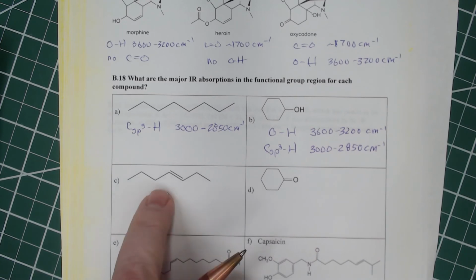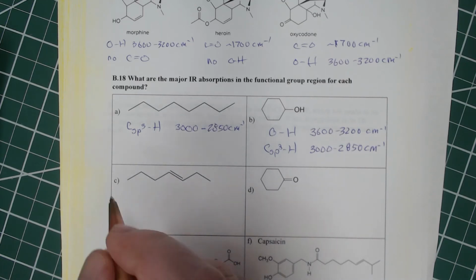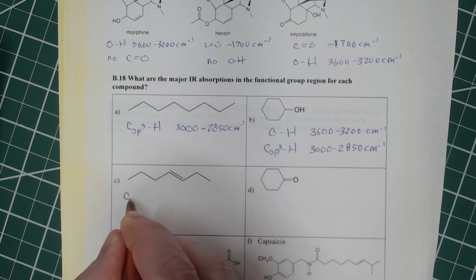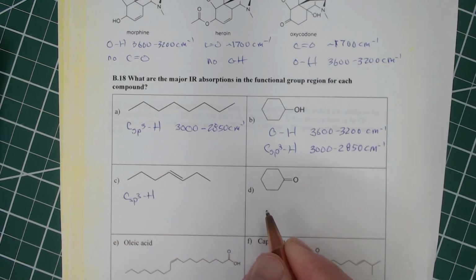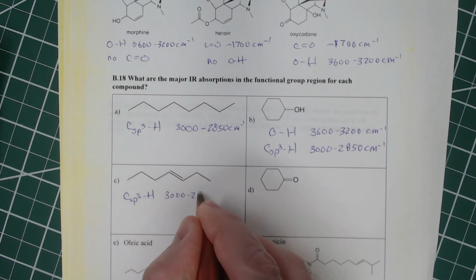All right. This one, the two most prominent things are going to be related to the double bond, but let's go ahead and put everything in there. So we've got carbon sp3 hydrogen. And that one again is 3,000 to 2,850.